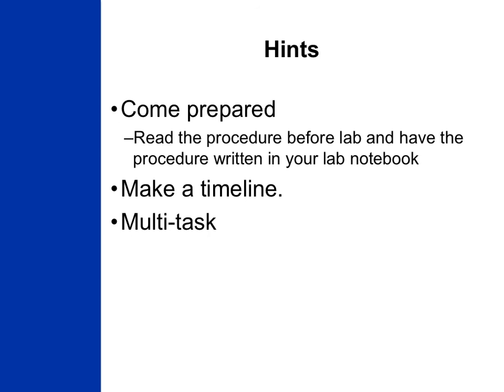Do you need to record a mass too? Maybe go ahead, weigh out that watch glass and filter paper. Is there some glassware that you can go ahead and clean so you're ready to leave the lab on time? Identify these steps so you can use your time efficiently and successfully. And when in doubt, before lab, speak with your TA in the General Chemistry Learning Center or ask the lab supervisor if you have questions about the procedure you're performing in lab.